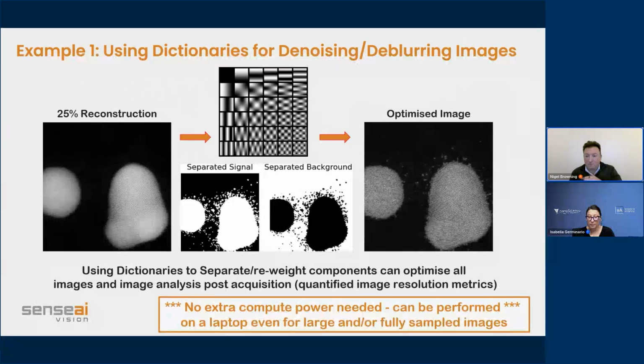In terms of a pure TEM selected area diffraction pattern, by definition, that's already sparse. It's just the Fourier components. And it doesn't really give us any extra information to try and in-paint that information. But 4D STEM data, which is diffraction data, absolutely. Nanobeam 4D STEM data, we can do things with in-painting and fill in missing information and deal with lower signals. That's actually very, very useful to do, but selected area diffraction, no.